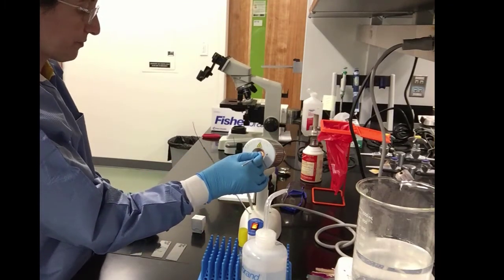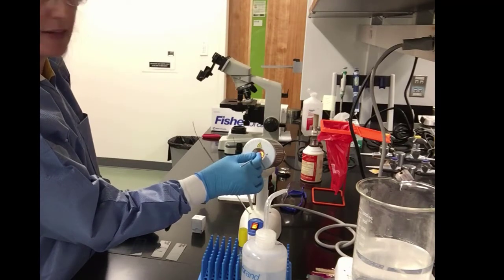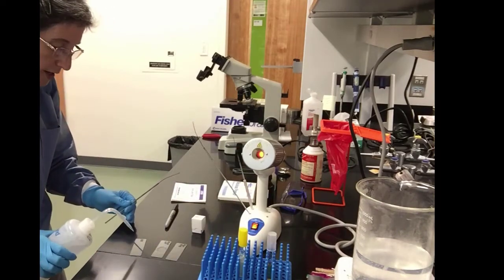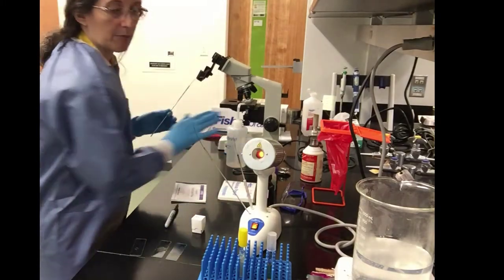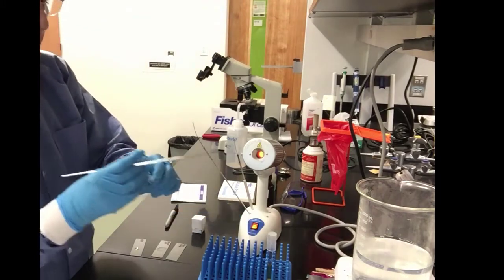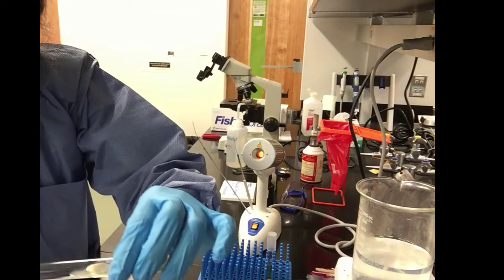We burn our loop, sterilize it, and now we are ready for the mix. Now for the mix, because we will use again the drop of water, we still have that staph and we do have the mycobacterium that's a little clumpy, so maybe this will help in diluting and spreading the bacteria a little bit better. We wait for our loop to cool and we first pick up our staph.